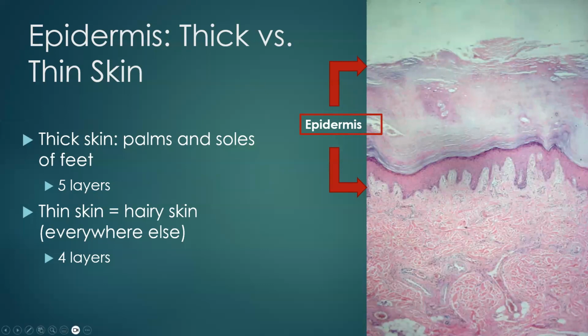And let's get into the epidermis. So you want to be comfortable with this image. This is straight from our modules.